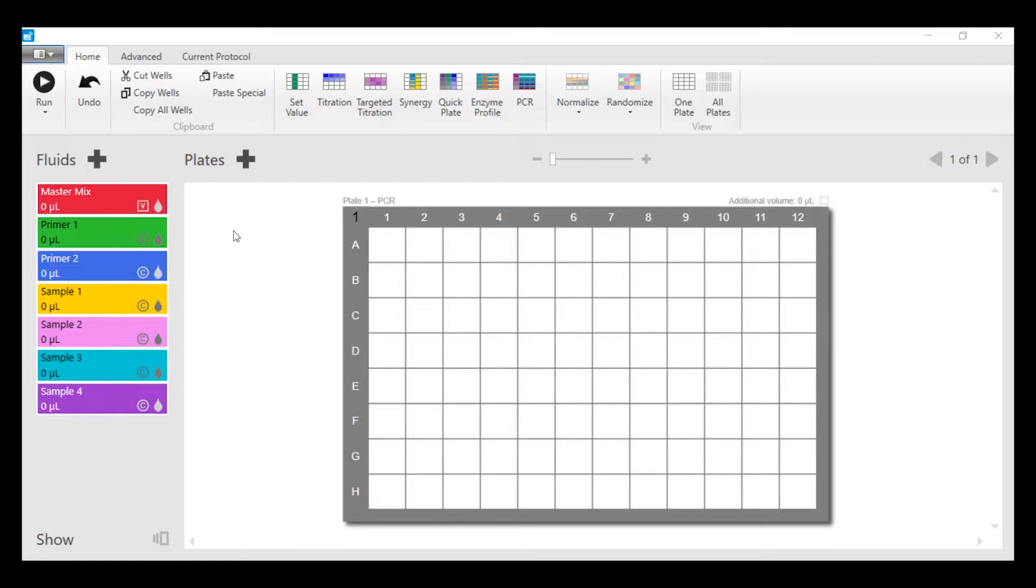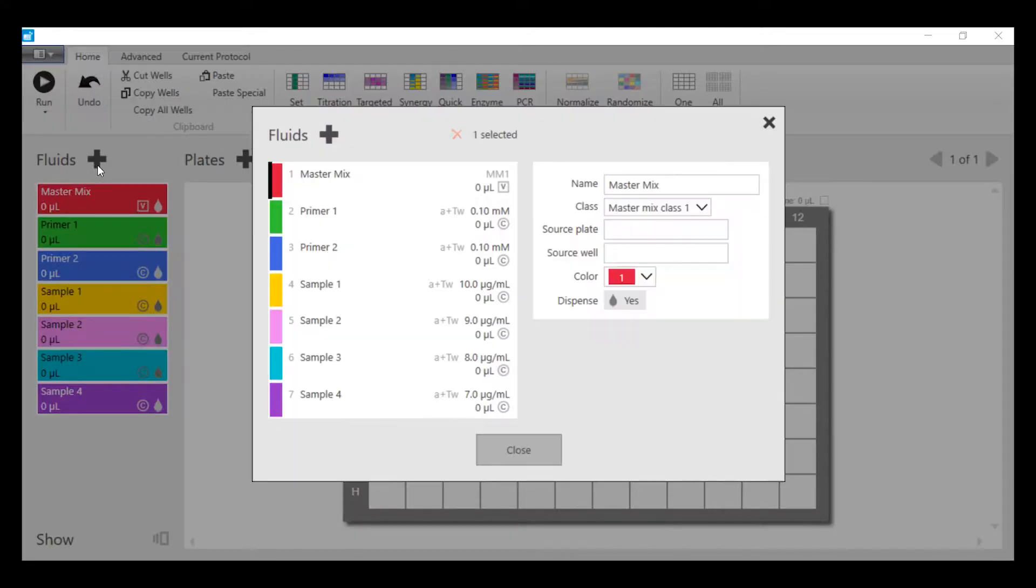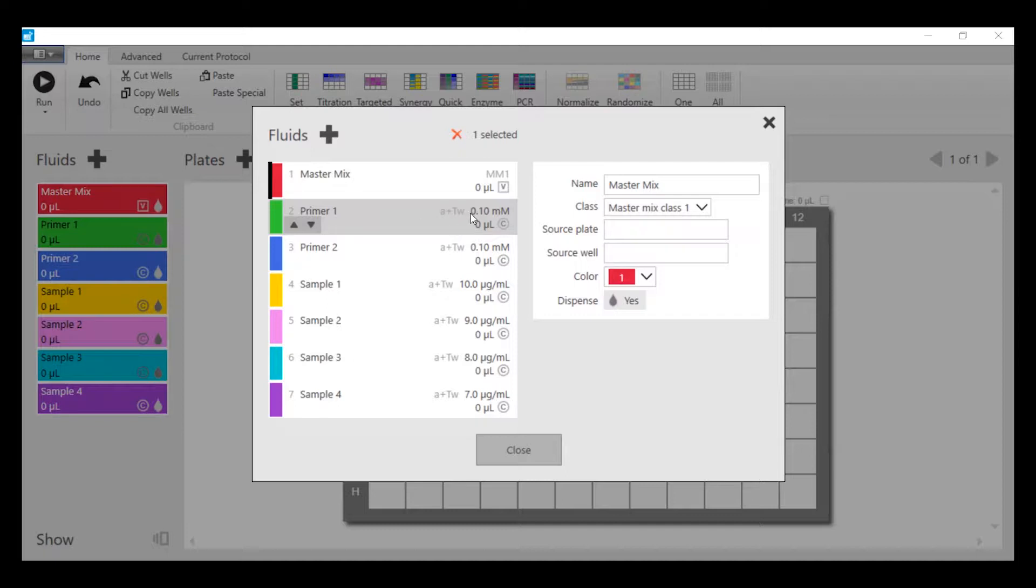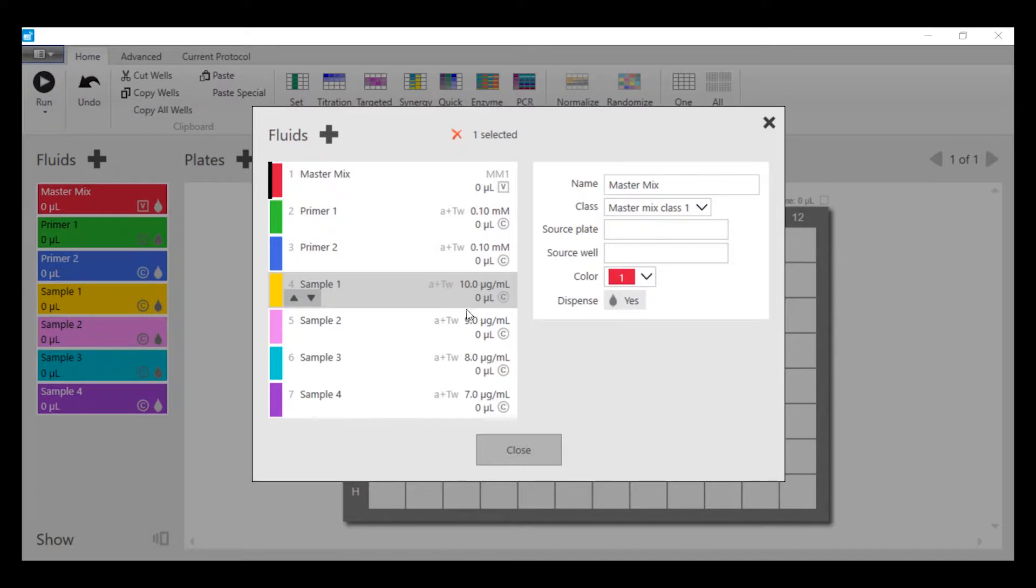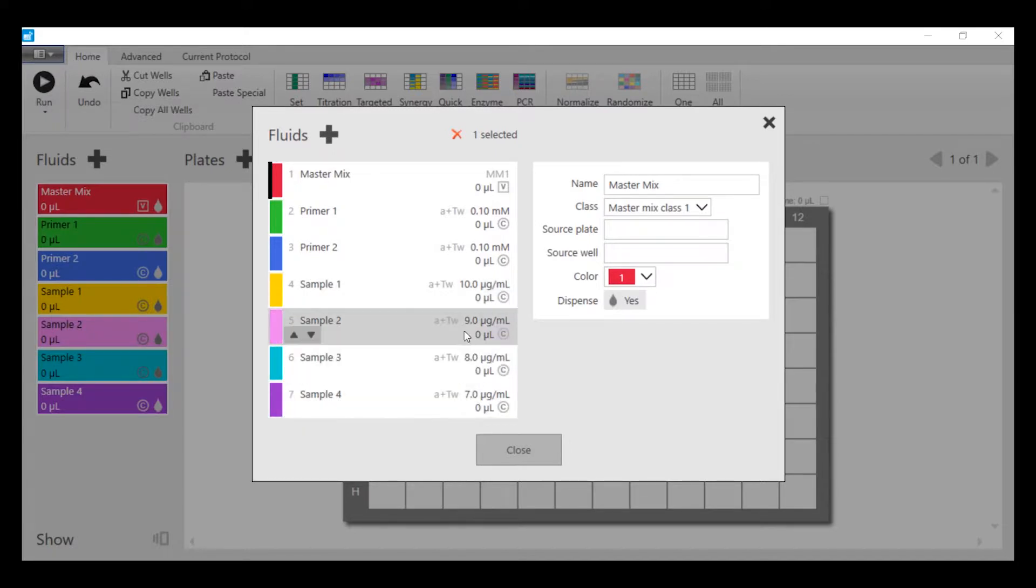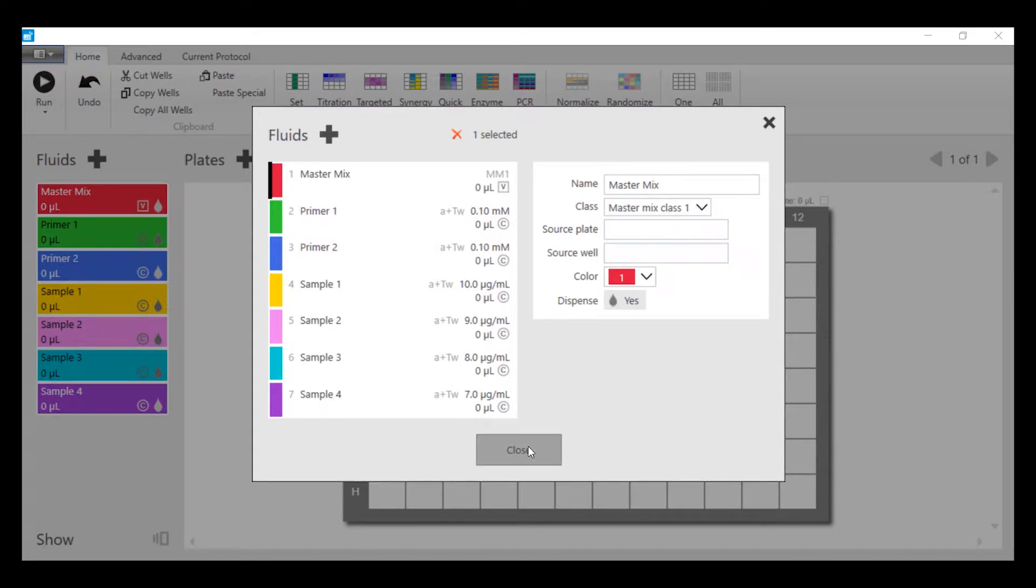We've already set up the fluids list. If I double click here I can show you that primers are set to be 100 micromolar concentration and the samples have different concentrations of RNA or DNA depending on what was determined previously. You don't have to pre-normalize the concentrations of your sample.